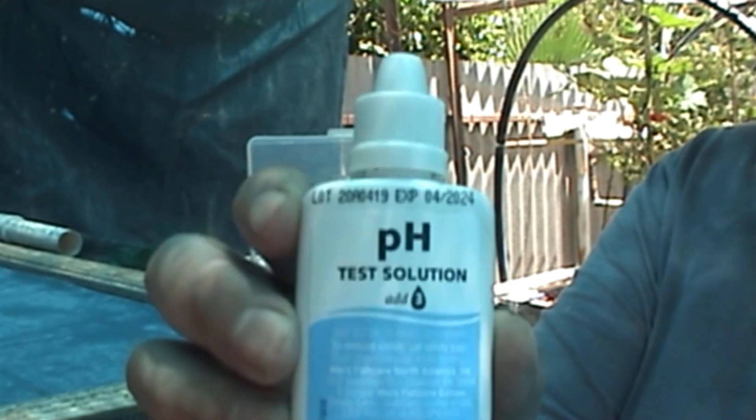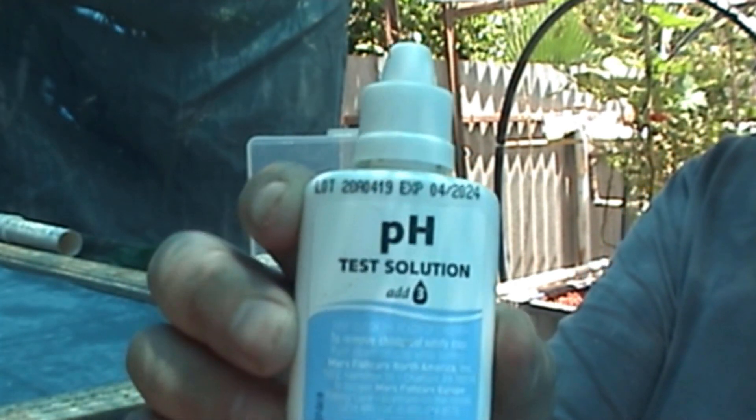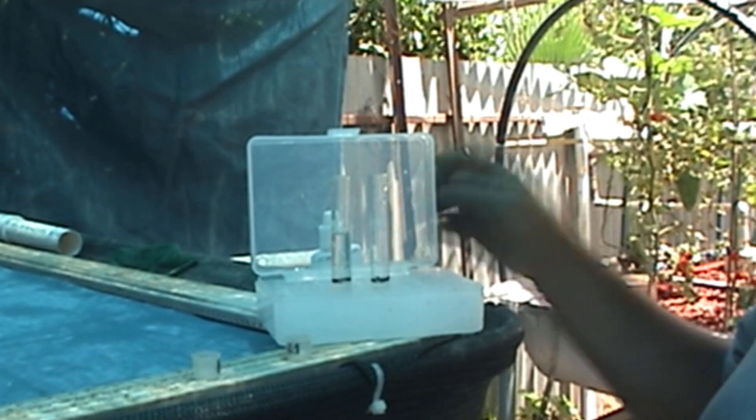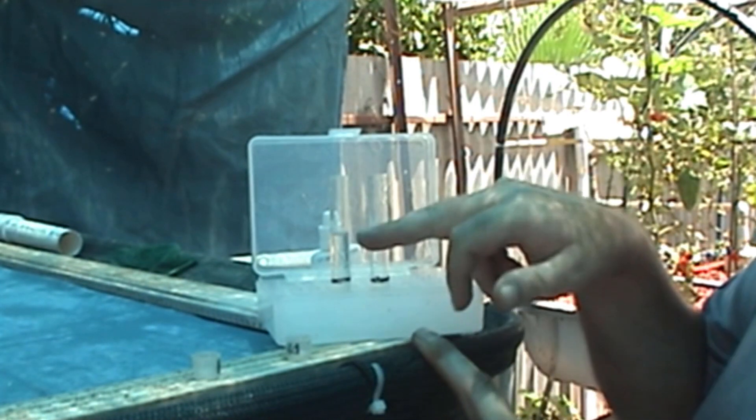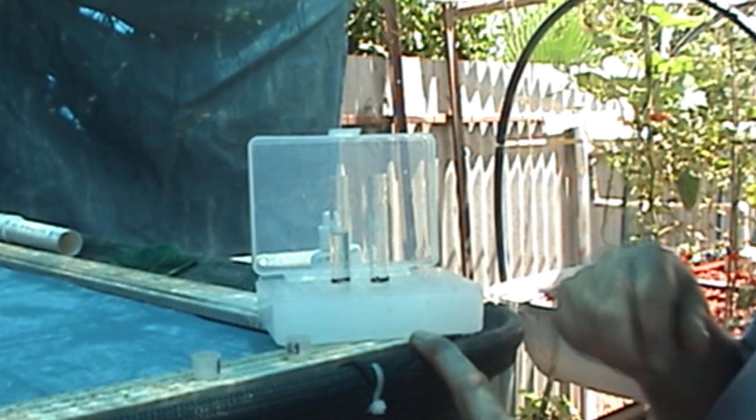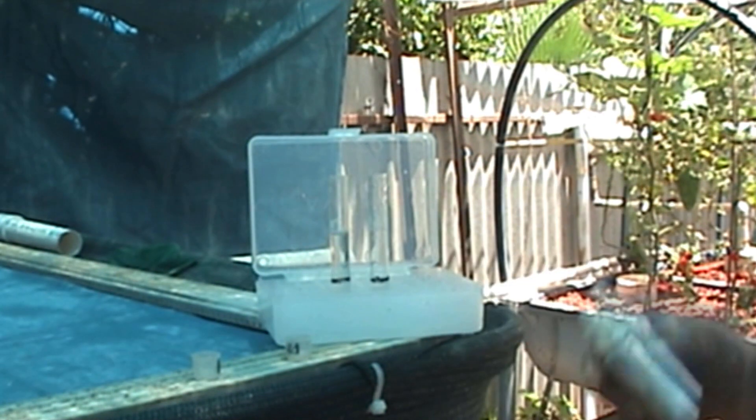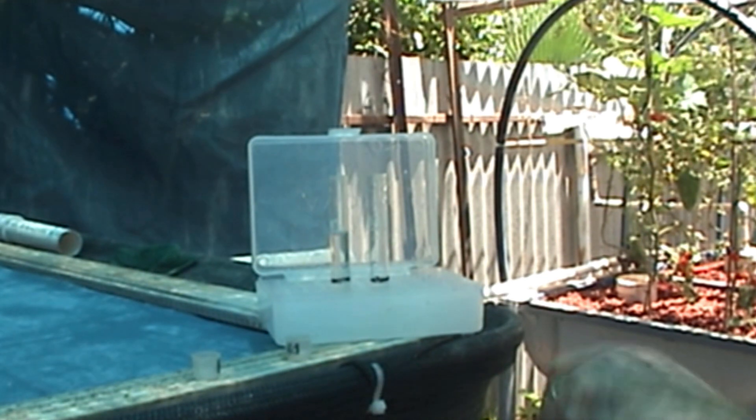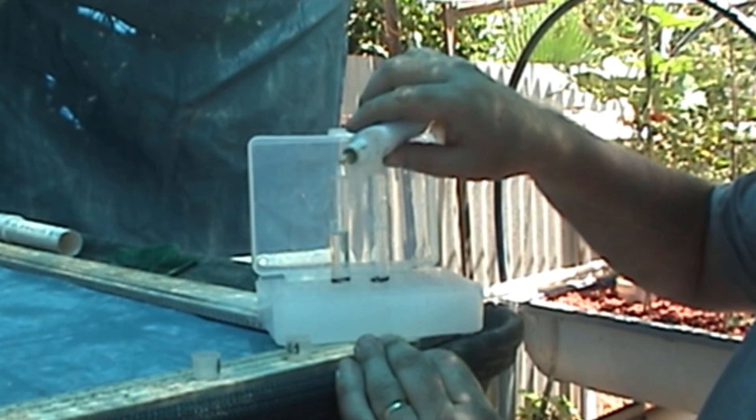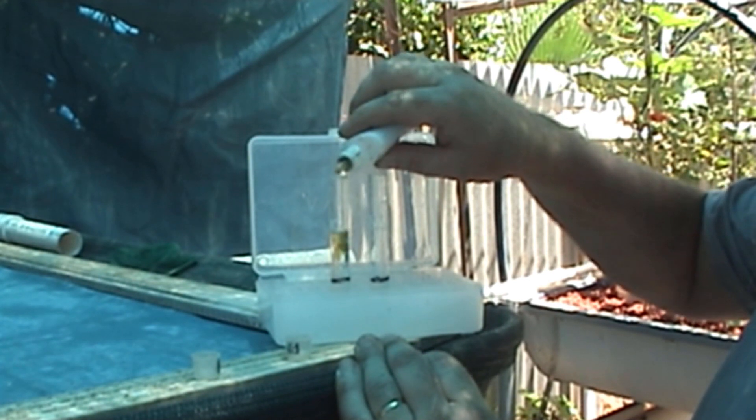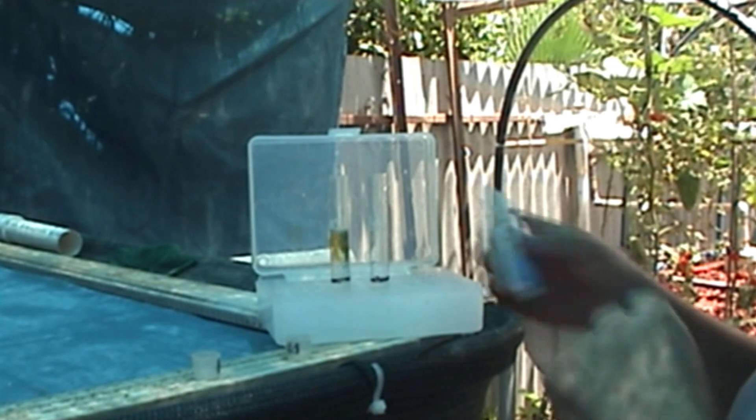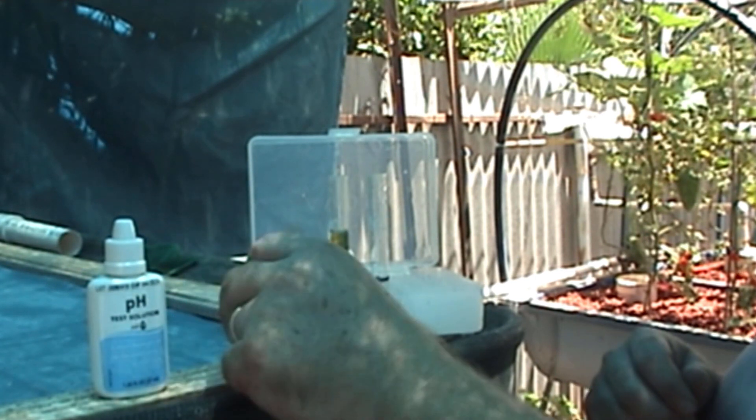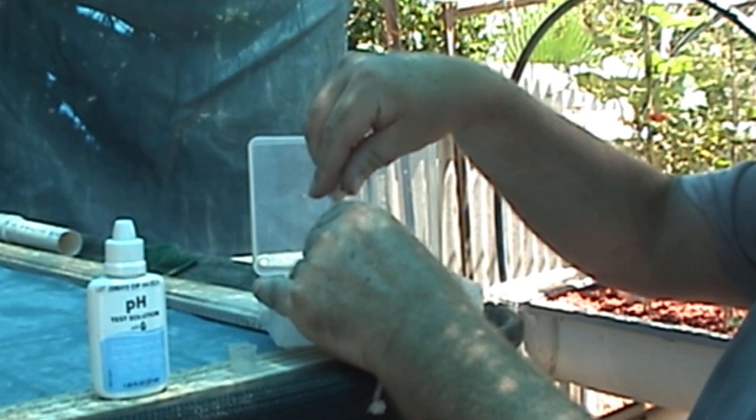The first test we're going to look at is pH, your normal pH, not your high pH but your normal pH test. I've filled up one vial to the proper level of where it's got to be. Now, I'll put the measurement, it says on here, put three in. I'll put three into that one. One, two, three. That's three drops. So, that's the normal pH test.